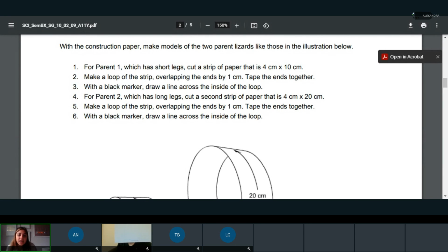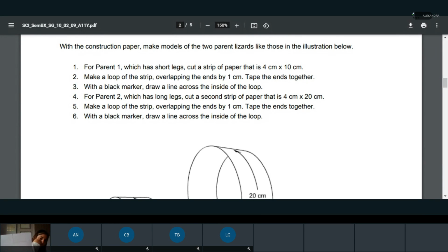So you are going to want to make that a little thicker. So remember, I know what you did. So we have our 10 centimeter line. You want to measure 4 centimeters using that line to make one thing like this. Okay, and then Logan, the 6th step is talking about drawing a line in your paper like that.